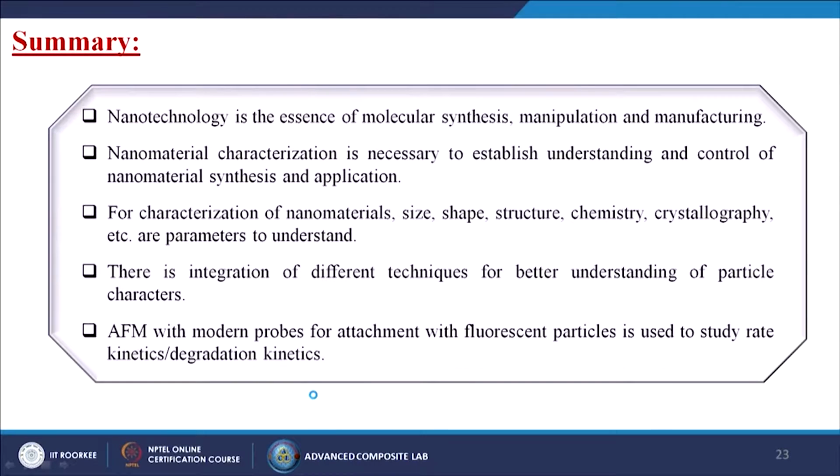So, now we have come to the last part of this particular lecture. Now, we have to summarize the whole lecture. In this lecture we have discussed nanotechnology, which is nothing but the essence of molecular synthesis, manipulation and manufacturing. Nanomaterial characterization is necessary to establish the understanding and control of nanomaterial synthesis and applications. For characterization of nanomaterials, size, shape, structure, chemistry, crystallography, etc. are the parameters to understand.